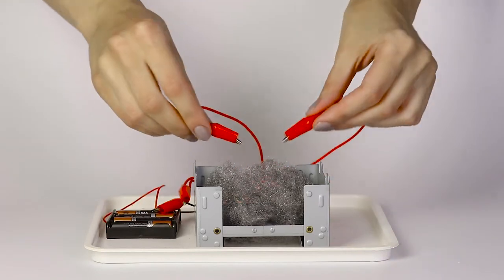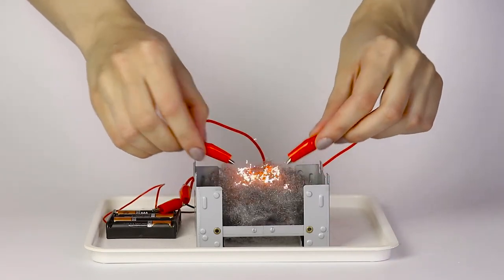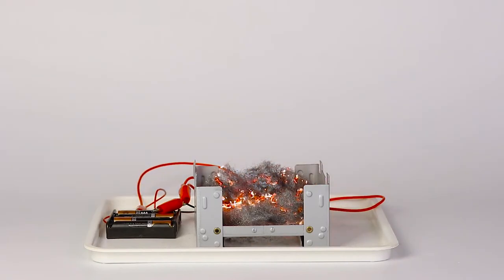Take the loose ends of the crocodile clip wires and touch the wool with them. The wool will ignite.